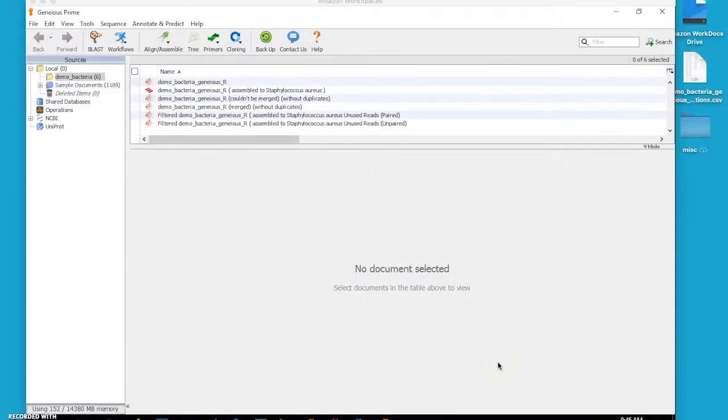Okay, so today we're going to talk about how to generate a Geneious variant call report file. This is a question that we get frequently from clients who are using Geneious, and they want to know how we generate our standard variant report file. And we're going to show you how to do that today.